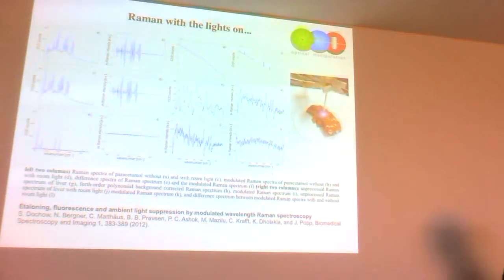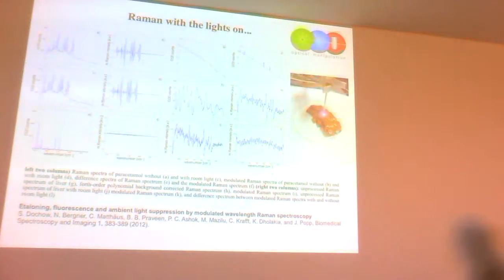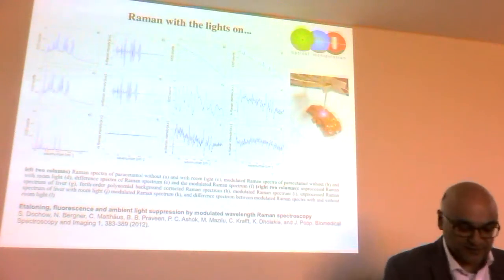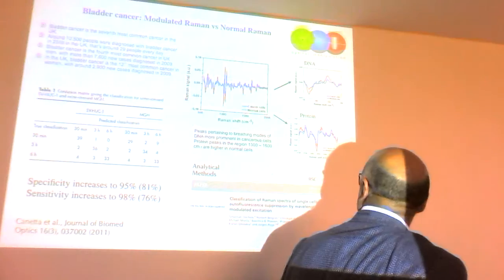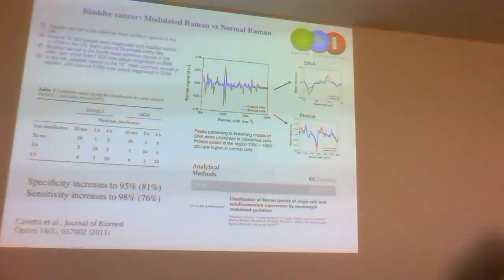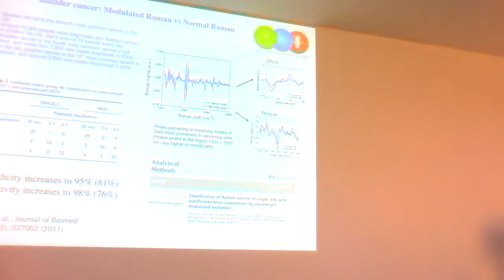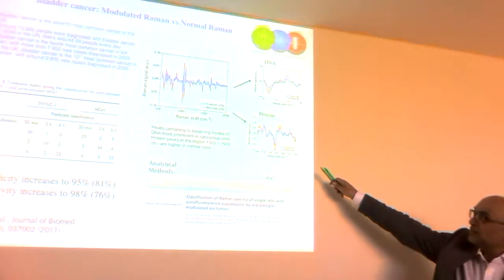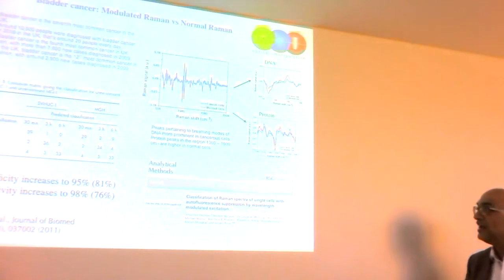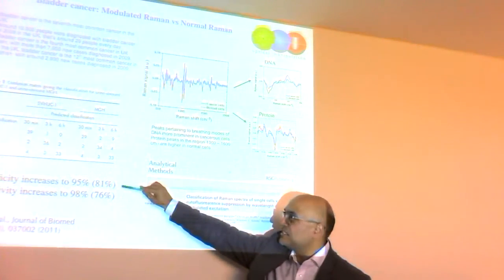And I won't go into all the data. This is both for tissue and also for the pharmaceutical industry, which uses this idea. There's other examples. This is just an example showing work with a local hospital looking at these breathing modes of DNA which become more prominent. Remember I said there's changes in the DNA structure that you have in protein peaks, and the improvement here is seen in the sensitivity and specificity.